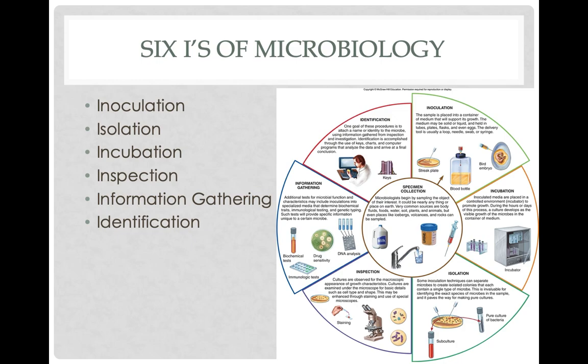So anyway, on to the 6 I's of microbiology. We'll talk about these fairly briefly. They're pretty easy, and we'll walk through them.